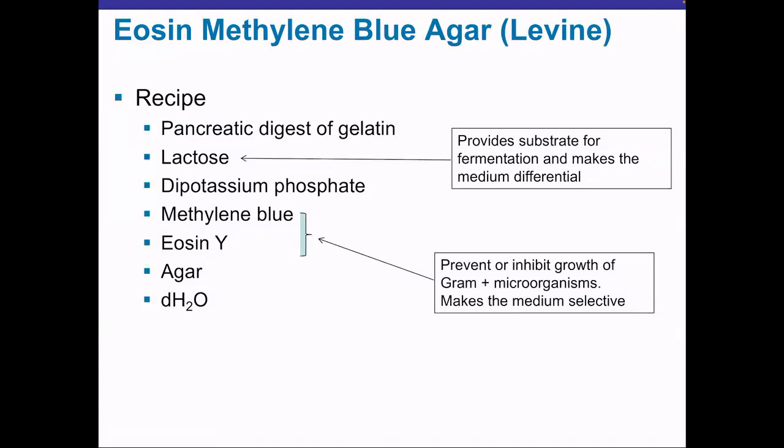That is the case of eosine methylene blue. That is also called Levine's formulation. Both are two names for the same medium. This is a selective, differential, and complex medium. Why is this complex? Well, right here, that ingredient is the main reason why this medium is complex.